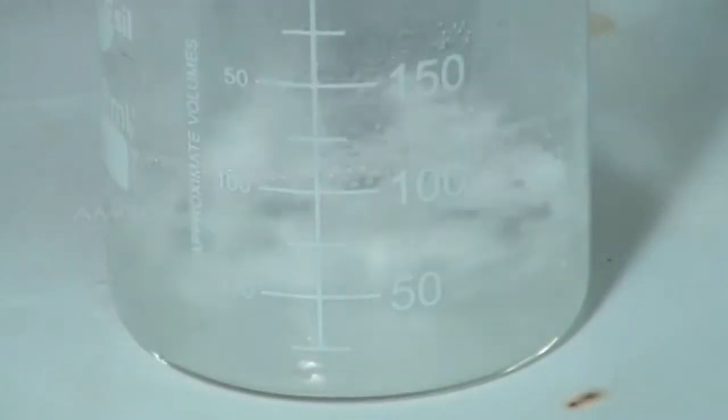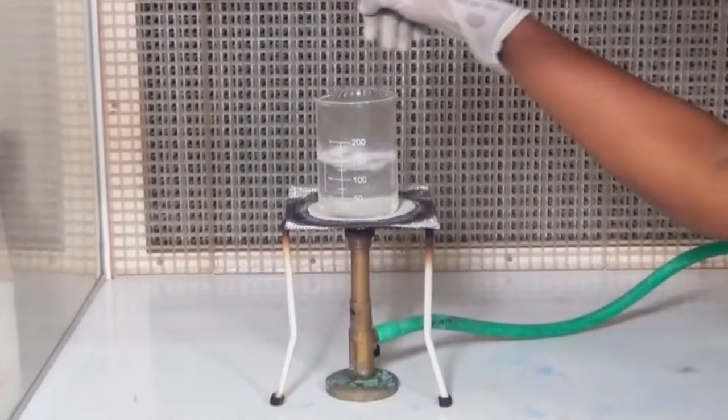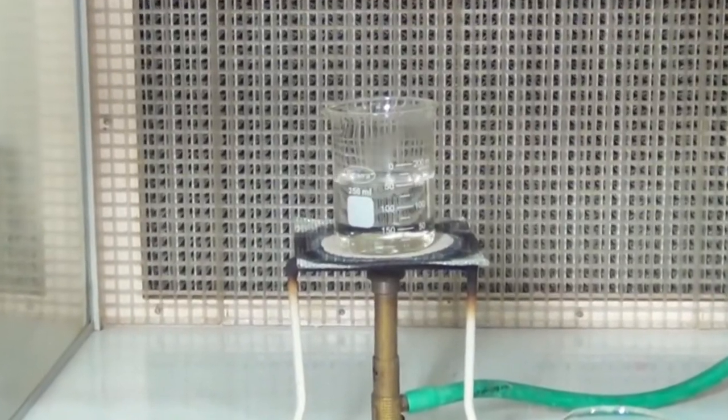Slowly pour the gum paste into the boiling water and with the help of a glass rod keep stirring it constantly. Once you have finished transferring the paste, allow it to boil for 10 minutes.